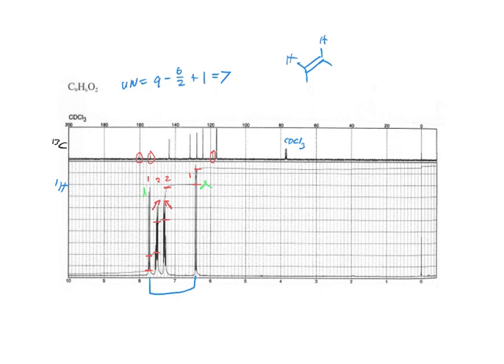So we're saying the outside 2 are doublets and doublets, right? That's what we're saying? No, the outside, you mean this one and this one? The green ones that you've labeled. Yeah. Those are just doublets. Right. Okay. And so they're likely on a double bond. And these 2, we have 4 protons, right? 4 that are likely on what? On a benzene. Right, so we've got a benzene ring that has like 2 substituents on it.